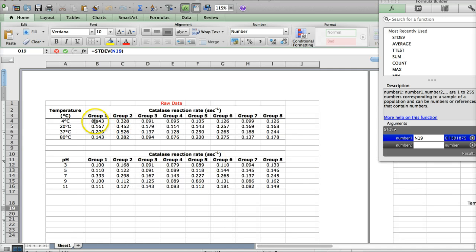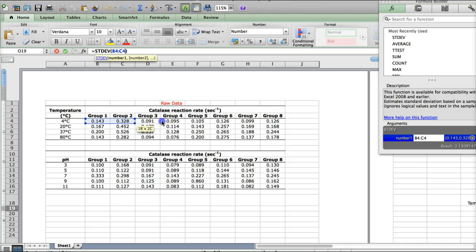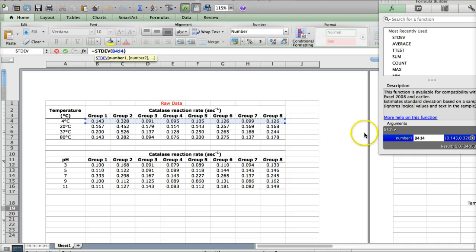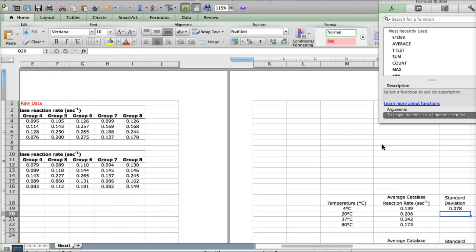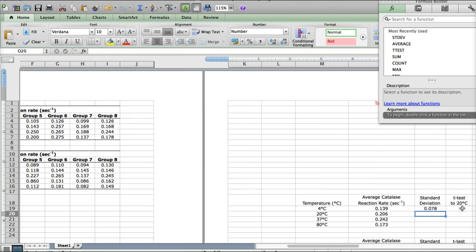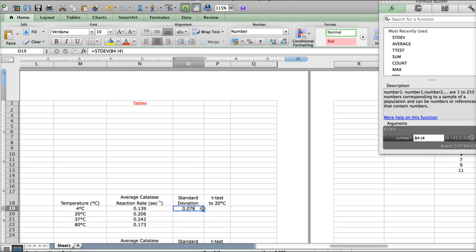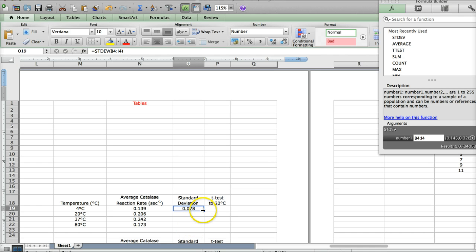We're going to go back to our raw data. We're looking at the four degrees Celsius temperature measurements. We're going to click, hold, drag across, and select all of those. Hit enter. And there you go. That's the standard deviation for these averages at four degrees Celsius.